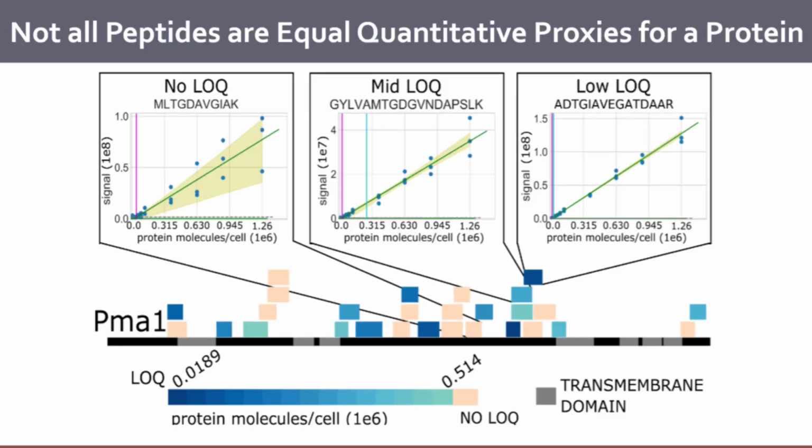Yeah, so it all comes down to whether or not that dilution curve, when you go lower than the endogenous amount, do you actually get a decrease in the signal? But like protein character, like the actual characteristics?